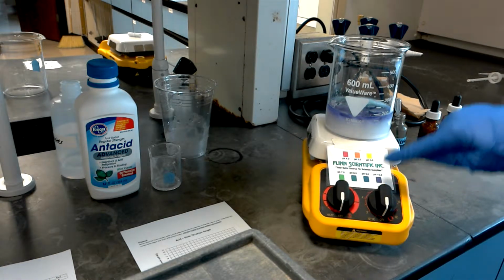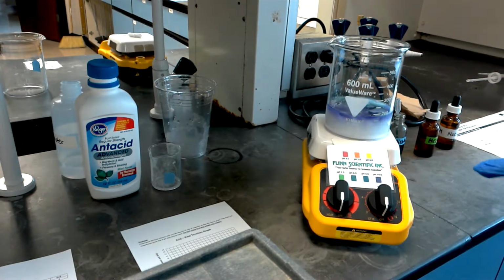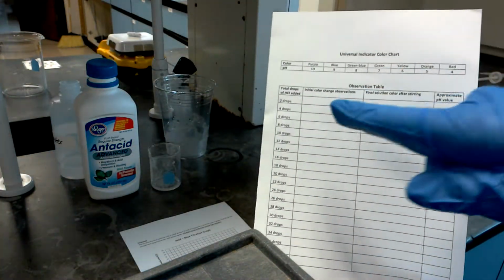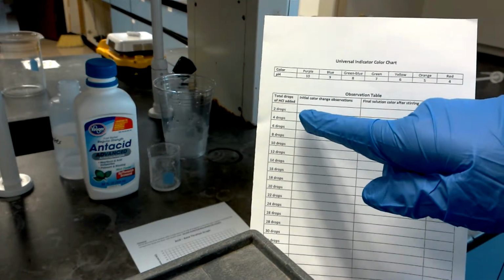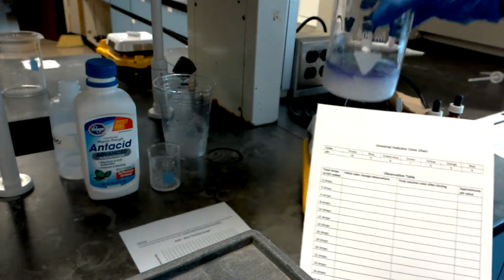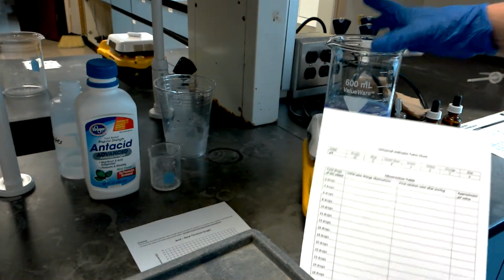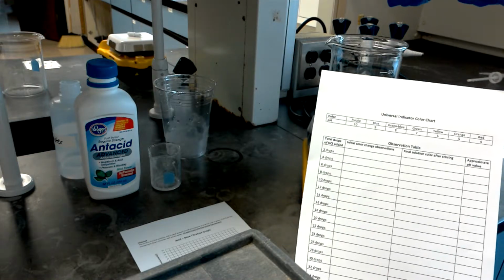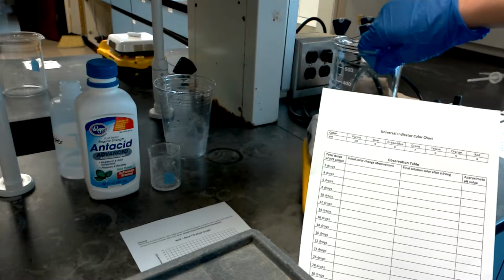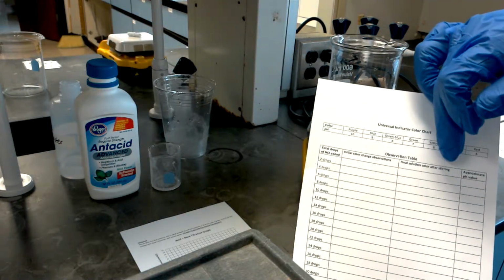Now, as we titrate this with the acid, you'll notice that we're going to continue to change our range of colors. Also, what's going to happen is for every 2 drops of hydrochloric acid you add, you're going to need to record both the initial color, which as you can tell inside this beaker, there are more than 1 color because it hasn't been well mixed yet. So when you first squirt in the hydrochloric acid, you'll notice that part of it might be a different color, but then as it's mixed, the solution will settle out to be a final color.